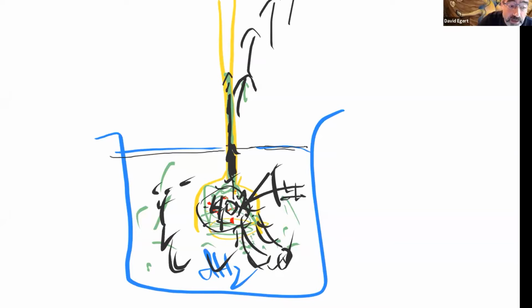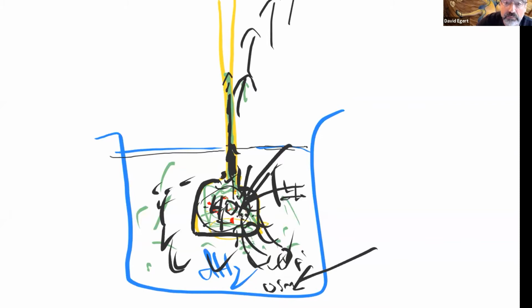So if you think about it, there's always going to be sugar inside here. It's always zero osmolarity out here. It's never going to be balanced, right? It's always going to be sugarier inside the osmometer than outside. It's going to get more dilute as it goes in, but it's never going to be equal, right? It's always going to be zero outside, and it's always going to be some sugar water inside. Will it stop, or will it just slow down so much that you can't even really tell? So one thing, we can have a slowing down because the concentration gradient is getting less.